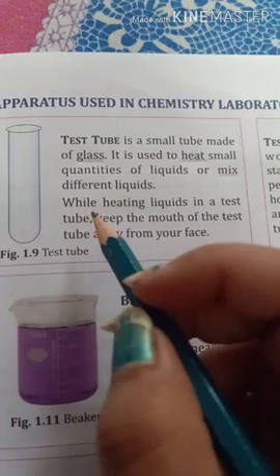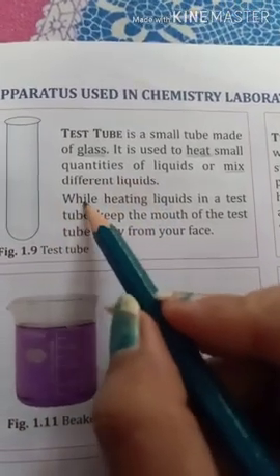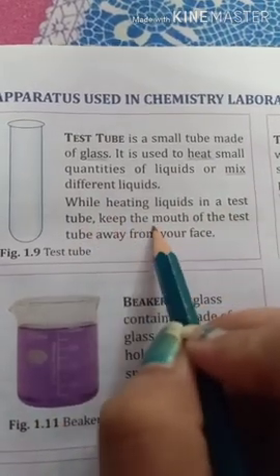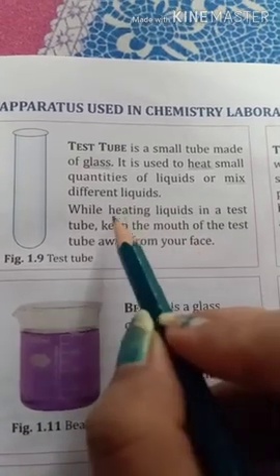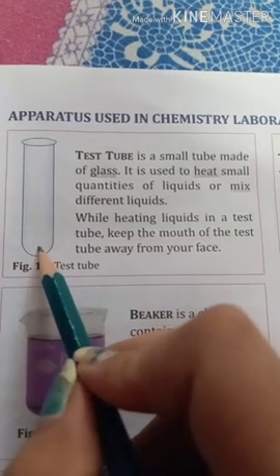So here we will take one precaution while using this test tube. Note, while heating liquids in a test tube, keep the mouth of the test tube away from your face. So this is the precaution we will take during the use of this test tube.